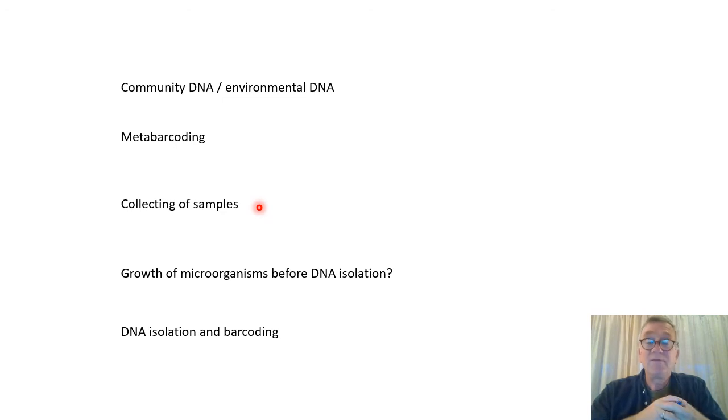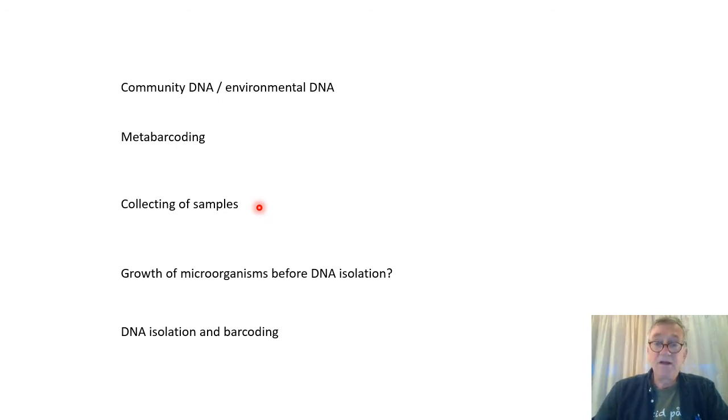The other type of sample was collected from computer keyboards from, well, how many? 4 or 5 offices around at the institute. I took a swab and put some buffer on the swab, and then I collected the sample with the swab from these 4 or 5 different keyboards. That is the 2 samples we have. If we had started earlier with the laboratory, you could have collected your own samples, of course.